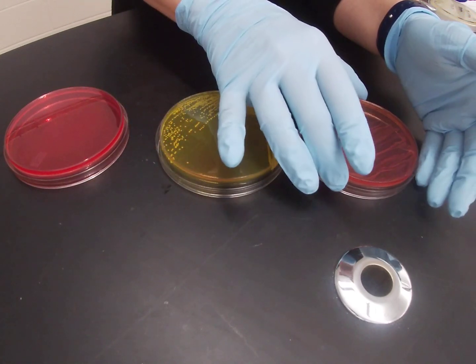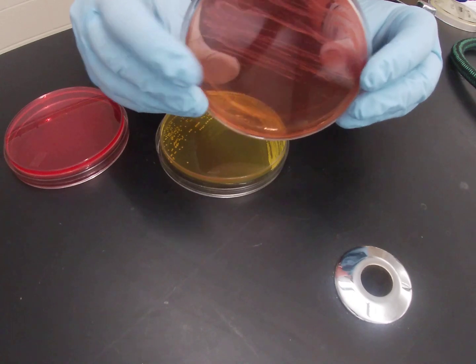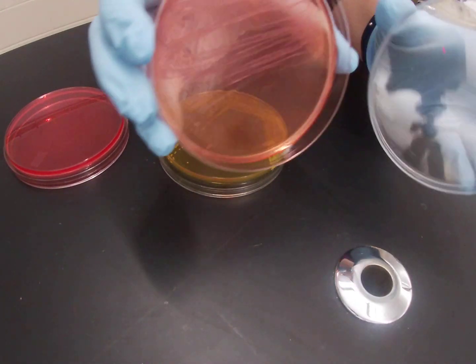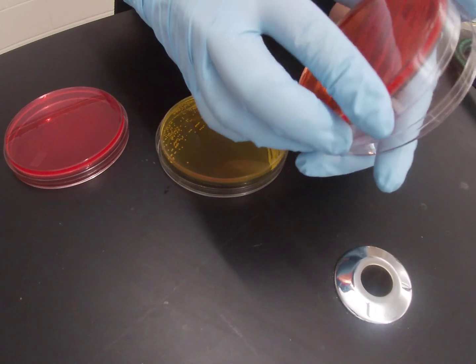Organisms that are able to grow on mannitol salt agar but not ferment mannitol grow on the plate, but the plate stays a more red color. Here you can see Staph epidermidis growing on a mannitol salt plate. The plate almost takes on a little bit more of a pinkish hue. So you can see the growth, but you can see that there is no bright yellow color.